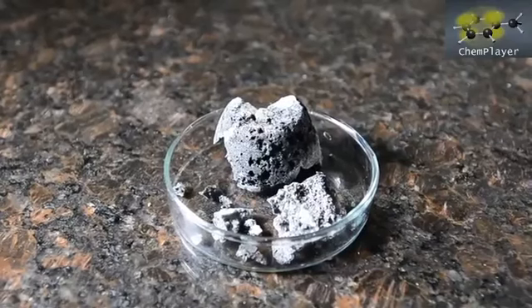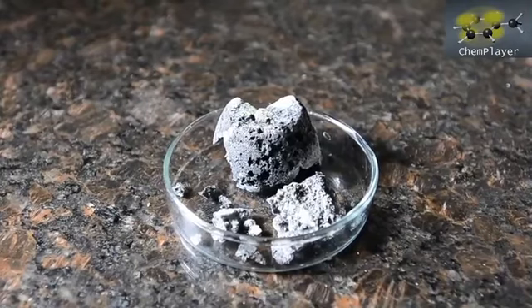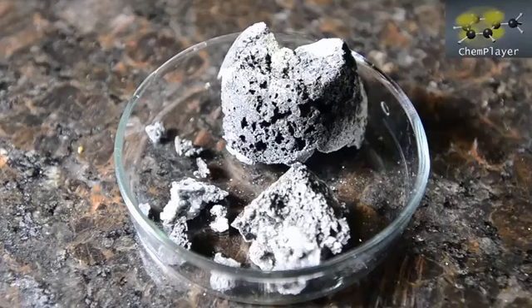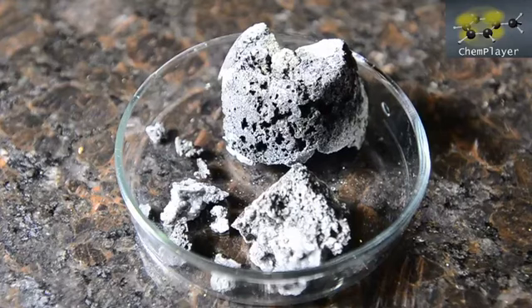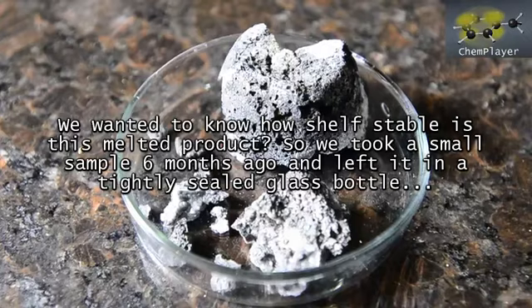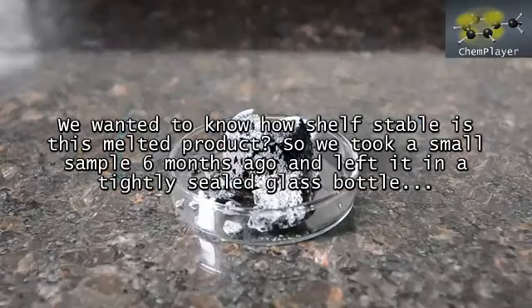And here's the solidified melt. This time we've got a product with a slightly spongy appearance, which is unusual. We think that heating in the metal canister is much better and more efficient for this reaction than the crucible. We've done an experiment to store this fused product as it is for 6 months in an airtight jar.